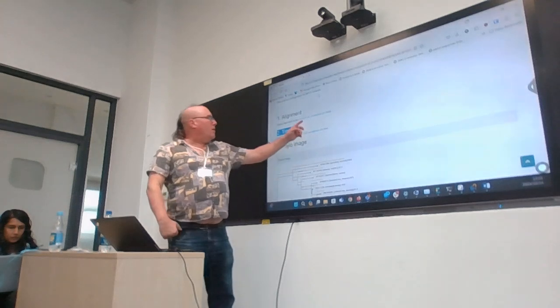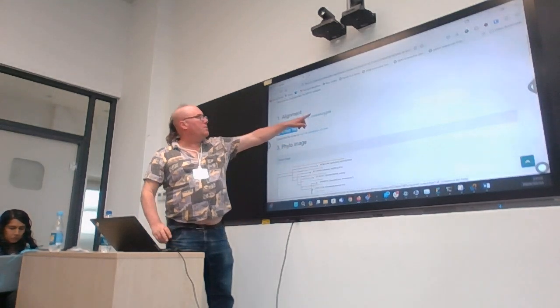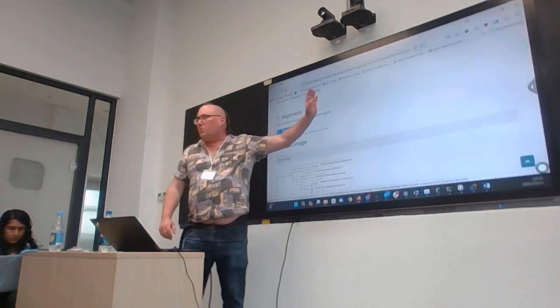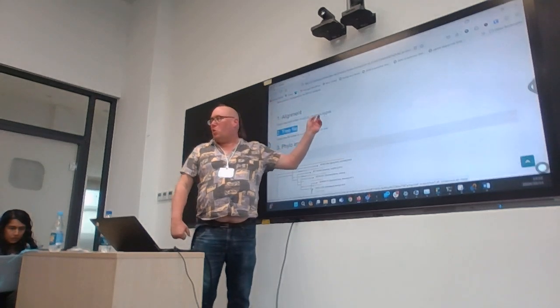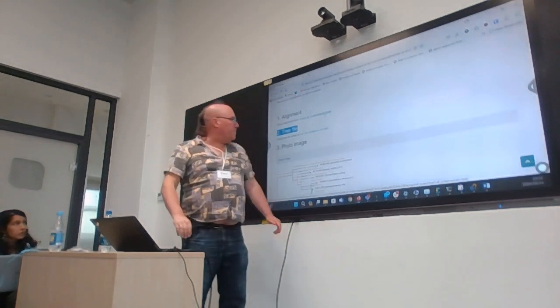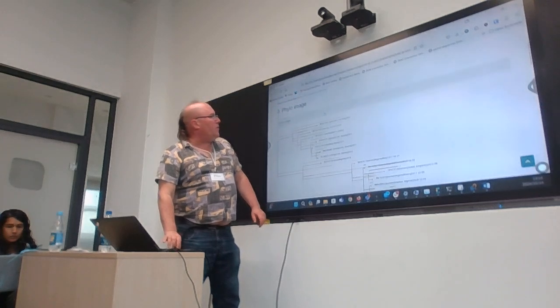It produces the masked genome. I mentioned the difficult to deal with areas of the genome. It produces the masked genome, but I also added some background data just to put this in context, so it produces a phylogenetic tree.